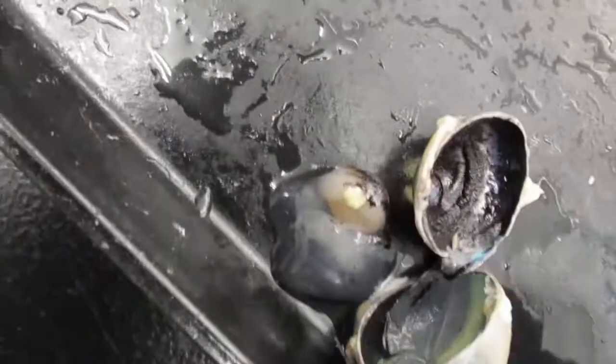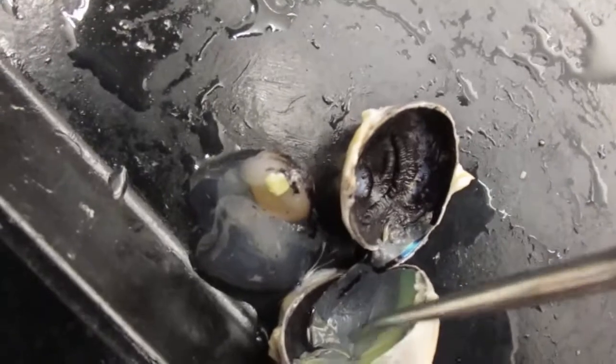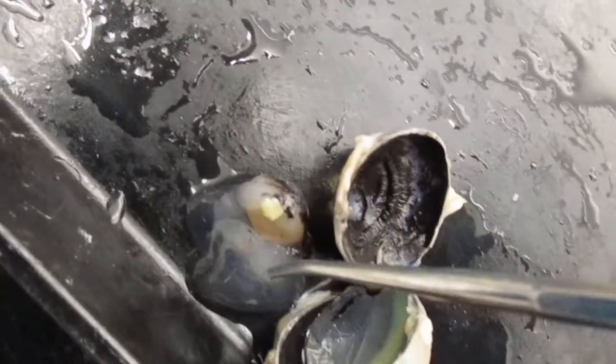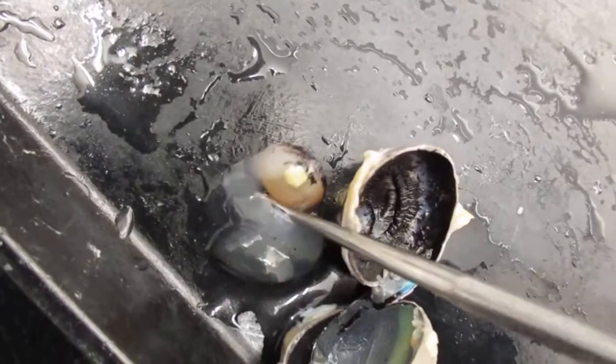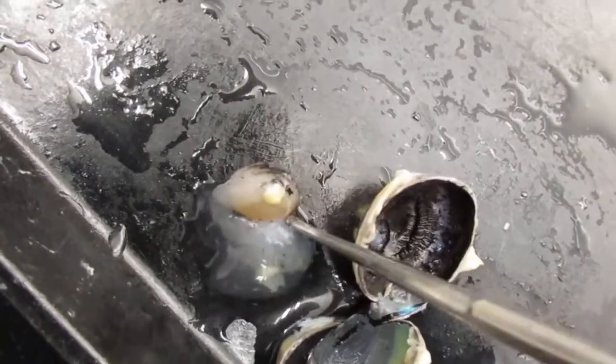Okay, now, you see this glob of stuff right here, sort of jelly-like? That's the vitreous humor. It came out of this. So this is your vitreous humor. This structure right here, this is the lens.